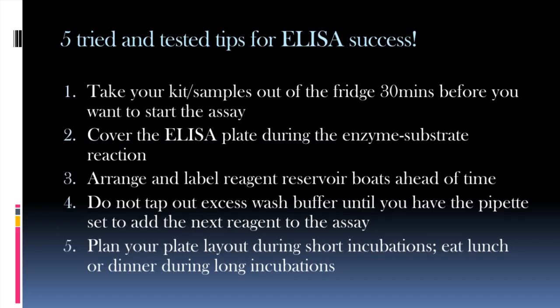And this can take quite a little bit of time, maybe 10 to 15 minutes, especially if you haven't done it before and don't have something preset and saved on your instrument. And so there are a lot of short incubations during the ELISA, and that is a good time for you to set that up. Also, there is the opportunity to get something to eat during the longer incubations.